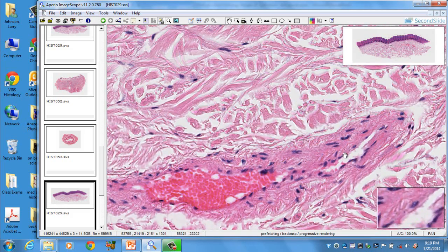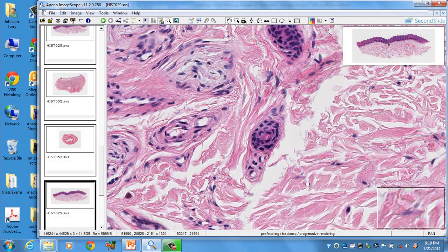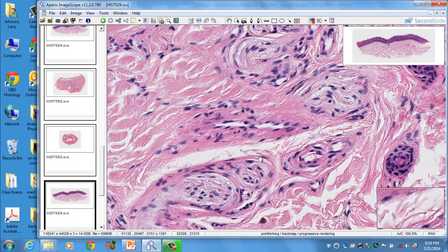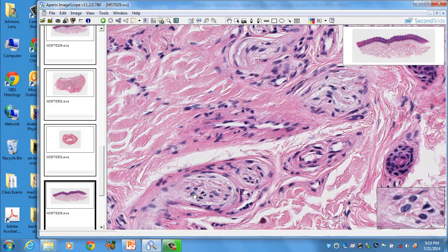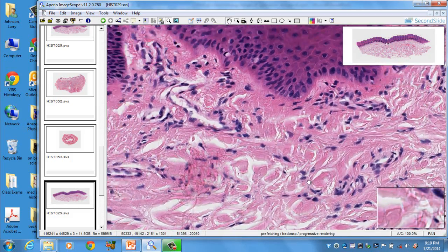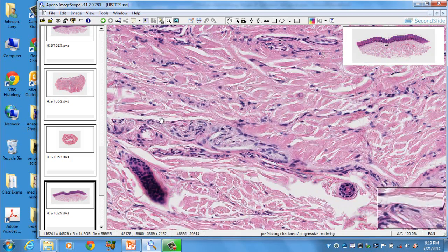There's the arteriole, you can see the endothelial cell, the smooth muscle cell, collagen bundles, and fibroblasts. We see another duct, and this is nerve. You have connective tissue around the nervous tissue. These would be Schwann cells, with a myelinated axon that we see there. Here we can see how nerve is more gray than the connective tissue around it. Collagen here and nerve there, collagen there.